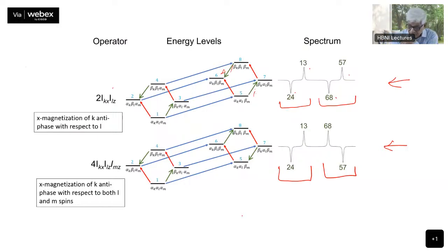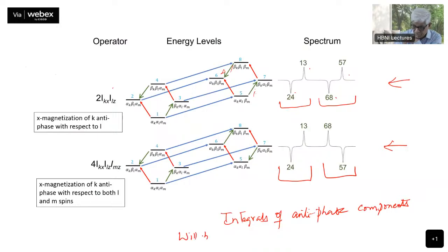So let me write here: integrals of antiphase components will be 0.